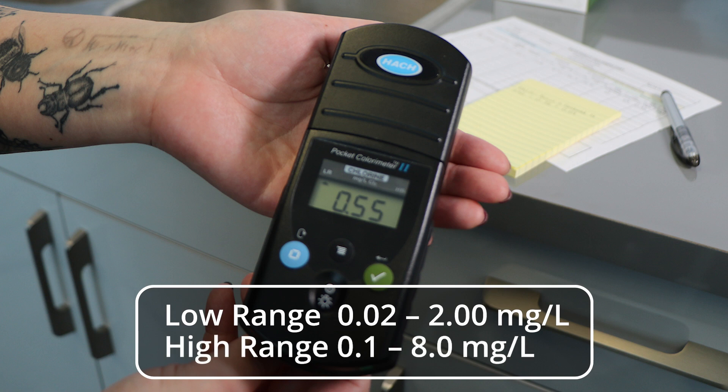The high setting reads measurements between 0.1 and 8.0 milligrams per liter. Please note that different test kits may have slightly different ranges.